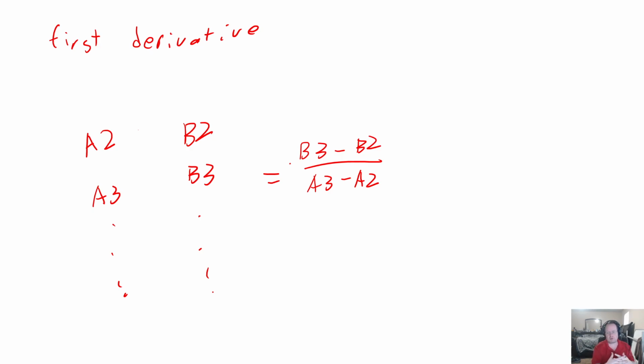Many times I see first derivative curves where the point for the first equivalence point in a diprotic acid has a first derivative value over 100 times lower than the one for the second equivalence point. Because when you get to the last equivalence point, you're moving to where you're in excess strong base, and a lot of times, at least with the particular acids we're working with, that's such a dramatic change in pH that it makes for a huge shift. Whereas pKa1 and pKa2, when you're looking at an acid, might only be 3 units apart, and so the amount your pH changes is smaller, which makes it more difficult to identify.